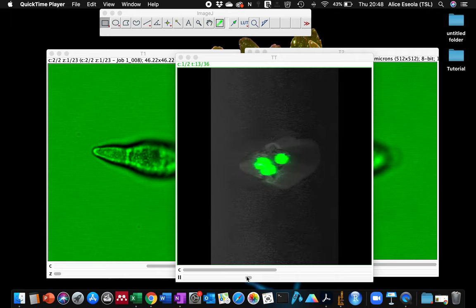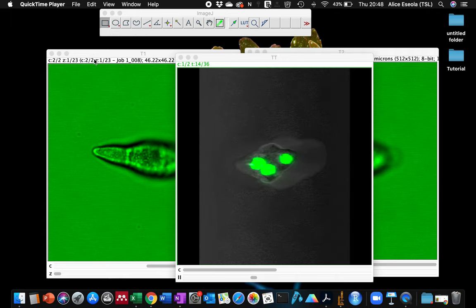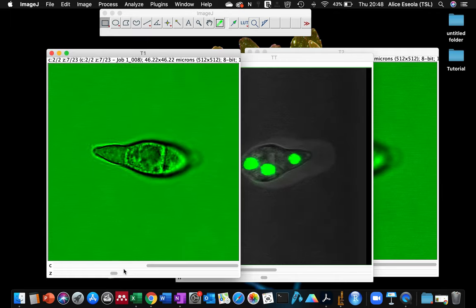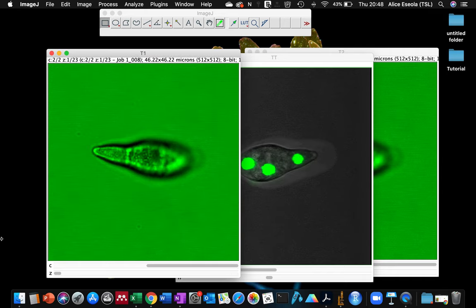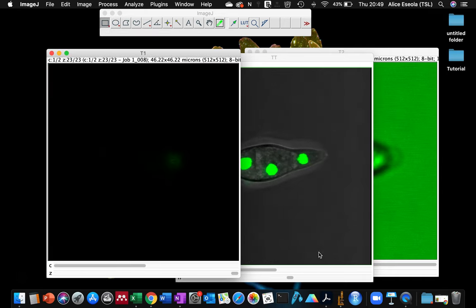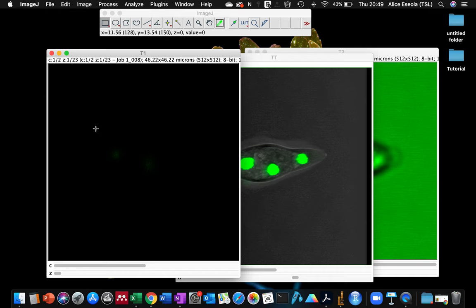Once you've opened your Z-stack image, like here I have my Z-stack image with both the fluorescence and the brightfield channel.